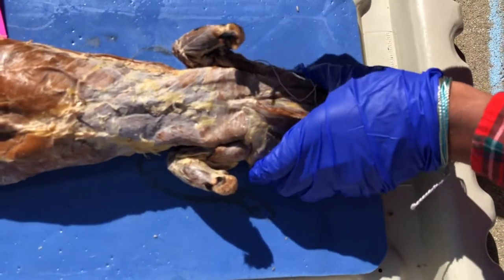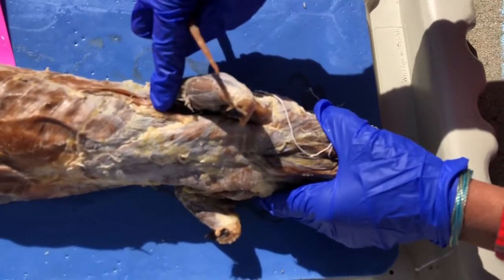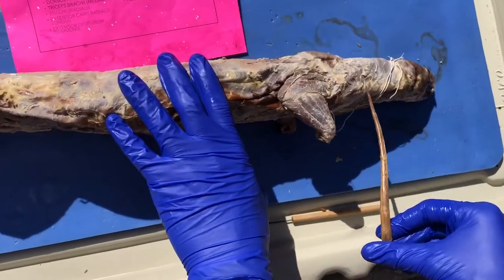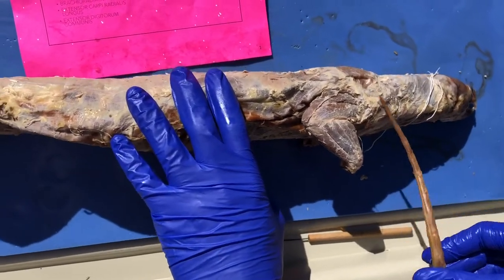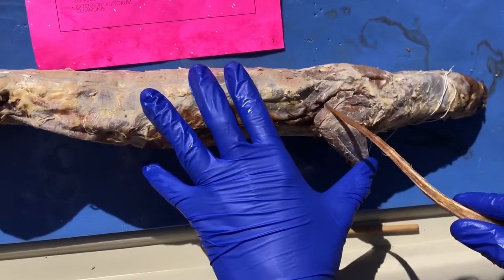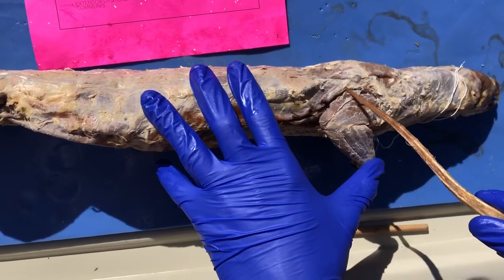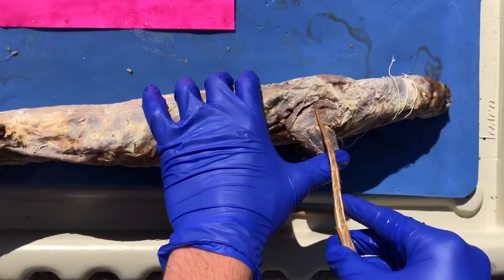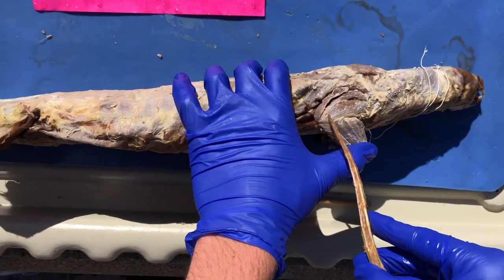And then this is the latissimus dorsi. Here we have the clavotrapezius, and then right up here is the acromiotrapezius, and here we have back here the spinotrapezius. Right here is the dorso epitrochlearis. The long head of the triceps is here, the lateral head is here.